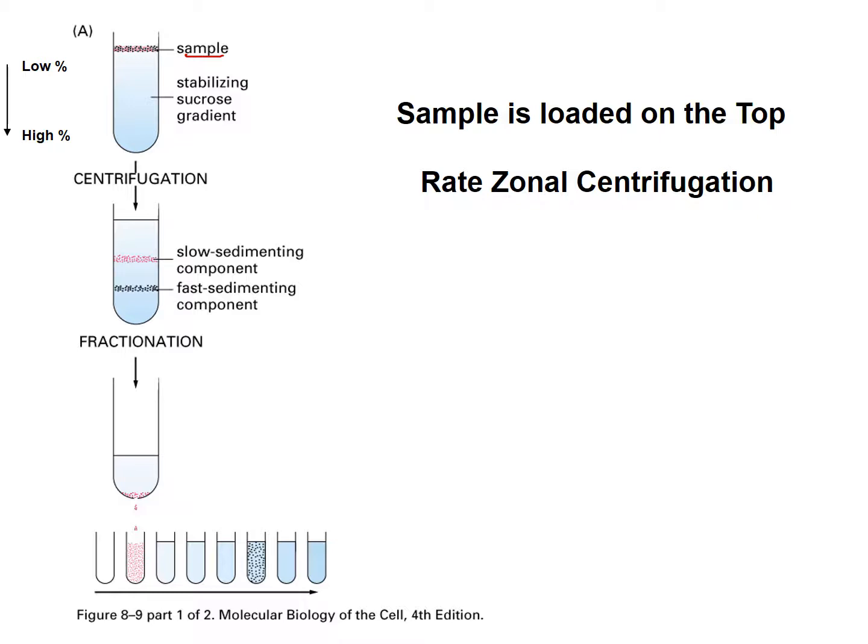In other words, you have 1.05, 1.051, 1.052, 1.053, 1.054, 1.055, 1.056, 1.061, 1.062, 1.063. So you see, you have a small slice, a little bit denser each time. It could be empirical, okay, EP, empirical. I may have to test this, right? And of course, you need to confirm what it is you're looking for. Are you looking for these or these, or both? It depends.